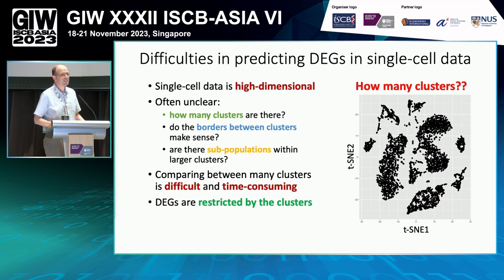Of course, it makes sense, I guess, but it's maybe not always so straightforward. Because this data is so high dimensional, it's very hard for us to actually look at the raw data to see if our clusters make sense, for example. Here I'm showing you the same plot without the colors. If I would ask you how many clusters there are here, I think everyone might give a different answer.